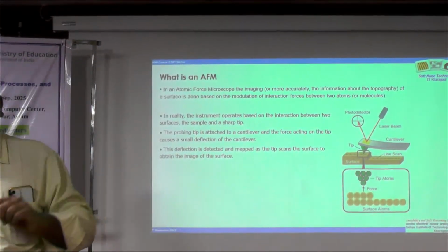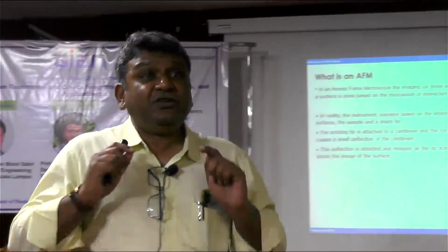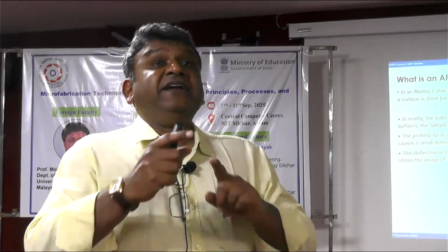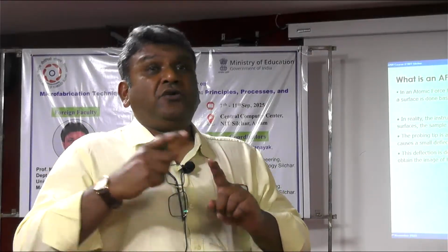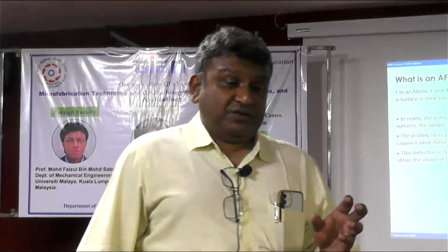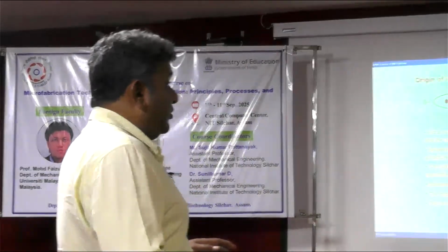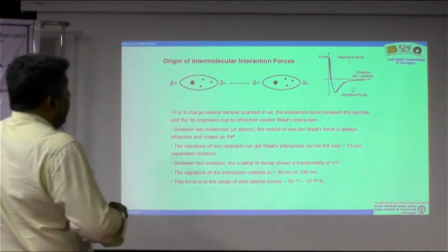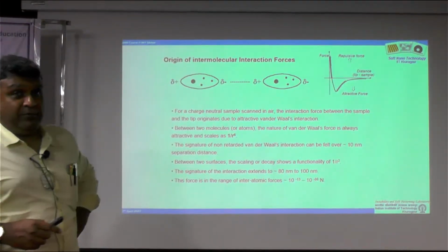So do you know about any force that is universal? So the answer to that is intermolecular interaction, or what we loosely call as van der Waals force. Because you all know about van der Waals force, I hope. So basically, in the simplest form, it is the induced dipole force.